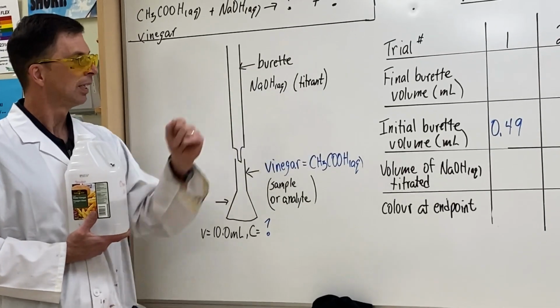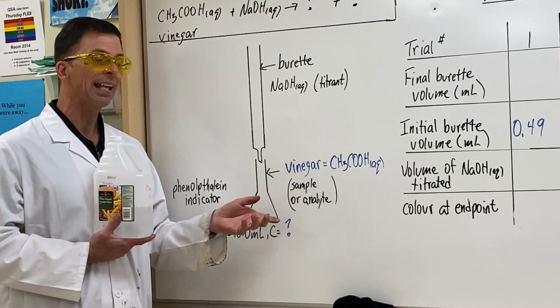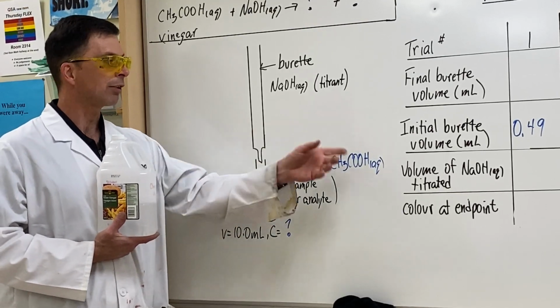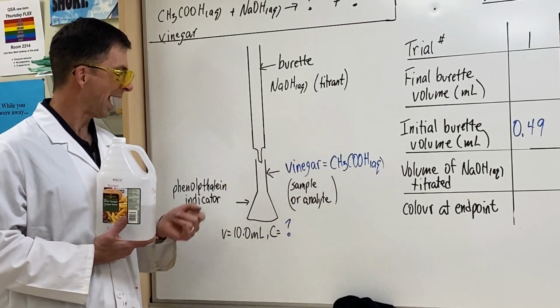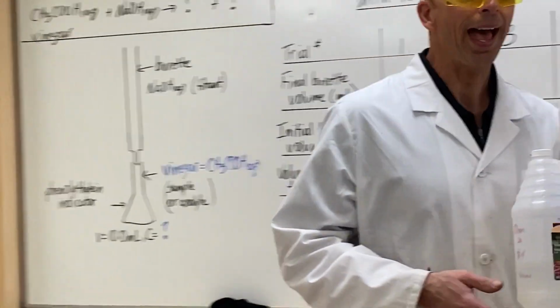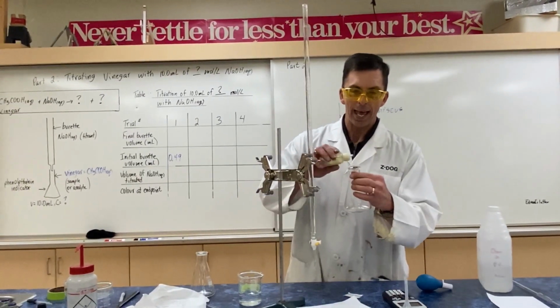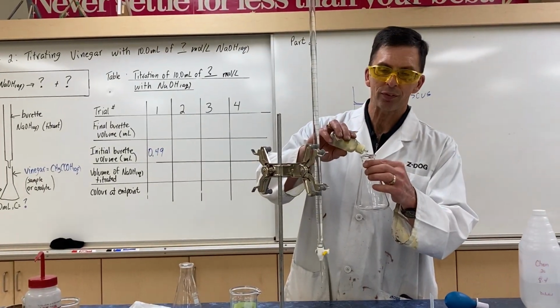Mr. Zed has loaded the burette. It's all ready to go. Our sample or analyte is the vinegar, and remember that's acetic acid. Once again, we use phenolphthalein as our acid-base indicator for the neutralization. Adding 2 to 3 drops of indicator.